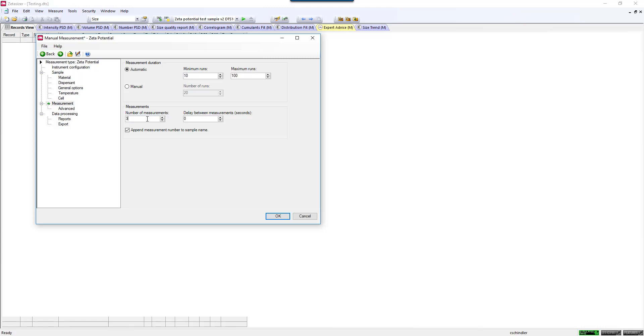Unlike a sizing measurement where it's a non-destructive technique, since you're applying a voltage to your sample, you can often cause some heating effects in your sample, which may disrupt the sample. So doing triplicate measurements might help you understand if you've made a change to your sample due to these heating effects. You want to make sure that this is not trending one direction or another during the course of these triplicate measurements.